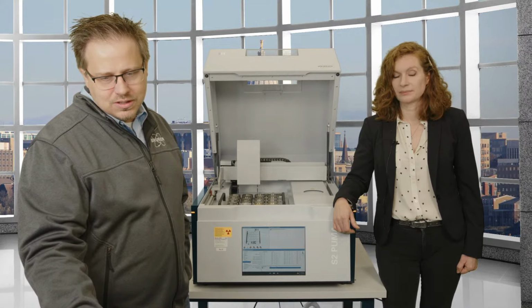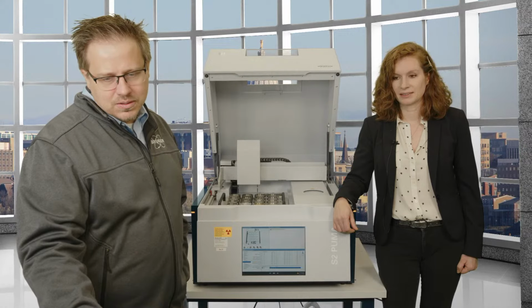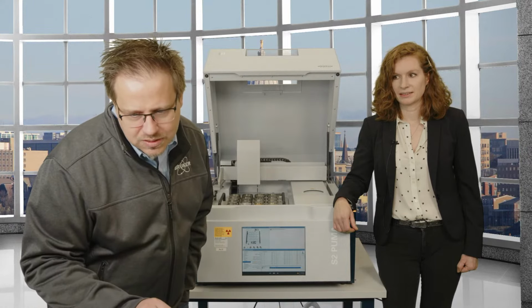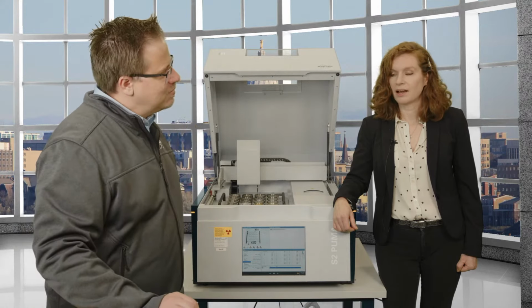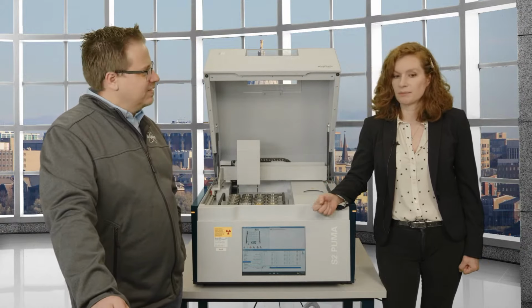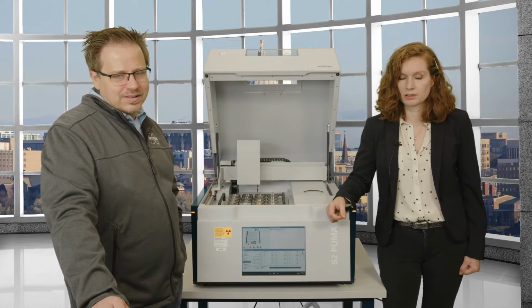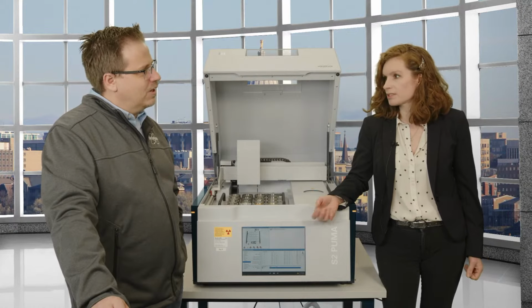With that, I don't see any other questions. Let me just check here. Oh, we got one question from Amir: Hello, I ask for Smart Matrix. It is quantitative application. Does that mean something to you? Yes, Smart Matrix is one of the default programs as well. And the matrix is CH2? Yes, the matrix is an organic matrix. It's usually used for oil.